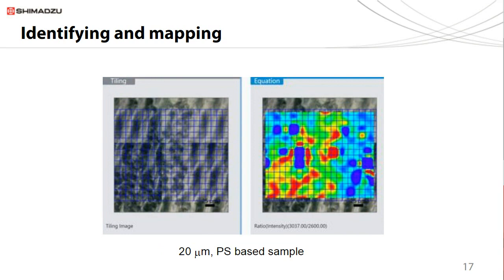One more example. On the left, slightly hard to view, are the polystyrene particles, only 20 microns in diameter. And on the right is the relative prevalence of the particles as determined by the infrared microscope. Although pure particles are shown to help better correlate the visible image with the mapped image in these examples, multiple types and sizes of particles on a single piece of filter can be analyzed at any given time. With the help of the software, multiple species and sizes can be identified simultaneously.